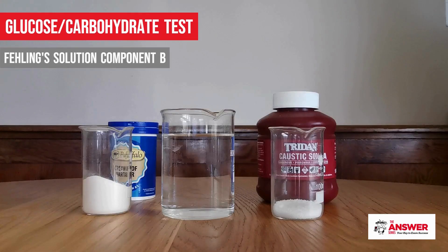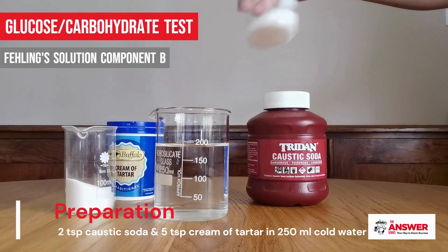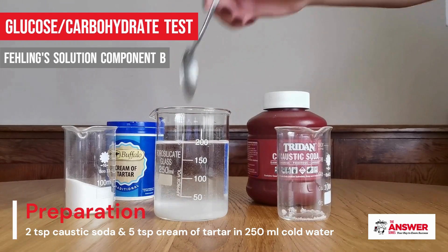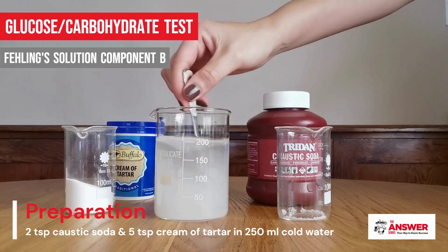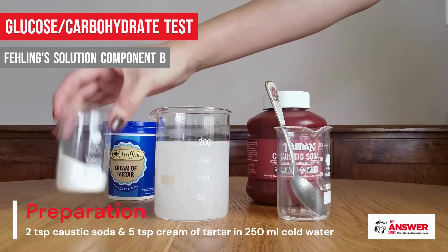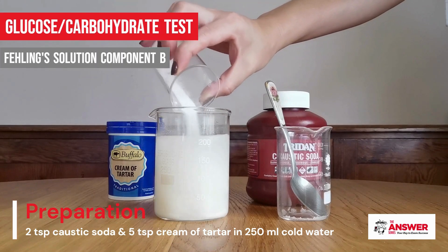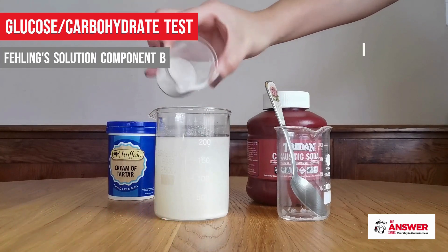Component B is a mixture of concentrated caustic soda solution and cream of tartar. To prepare component B, add two teaspoons of caustic soda to 250 milliliters of cold tap water and stir until it is fully dissolved. Then add five teaspoons of cream of tartar to the solution and stir until it is fully dissolved.